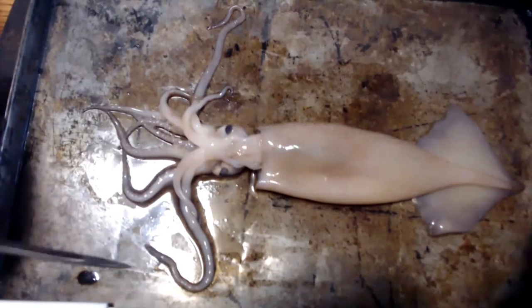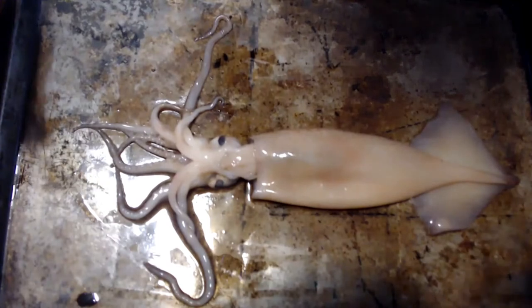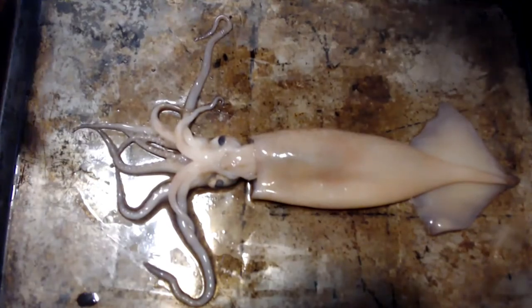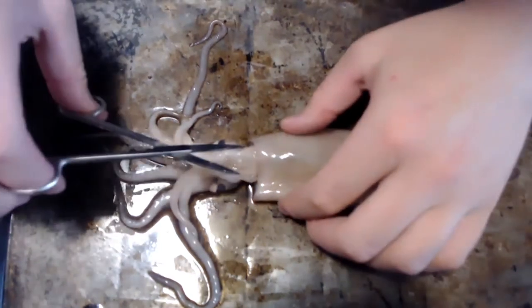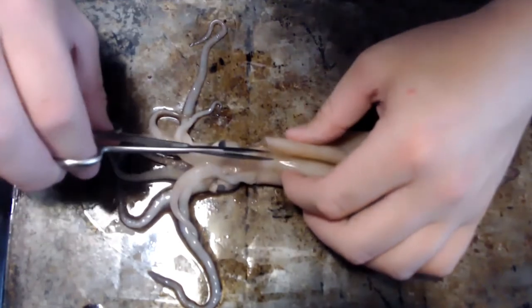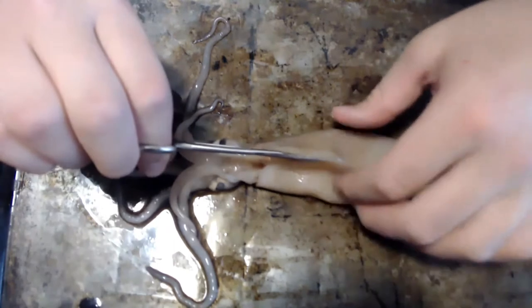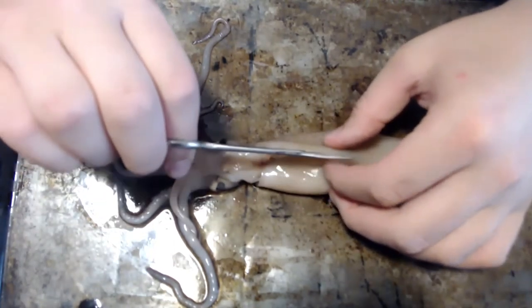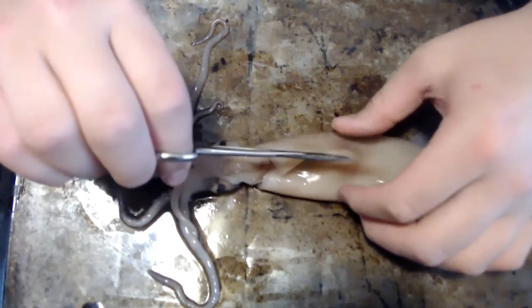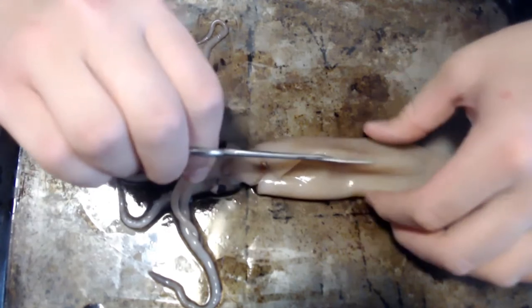I just wanted to give you guys that fun little story. I apologize that my camera can't let you see these rings — it's super fascinating. So let's open up the mantle. This is the really cool part, one of my favorite parts of the squid. My favorite part though is looking at the beak — it's one of the coolest things of the squid.